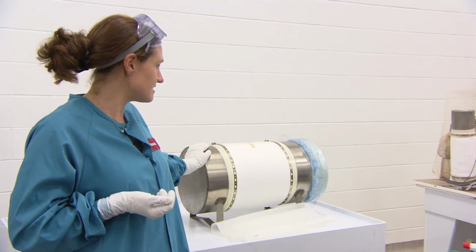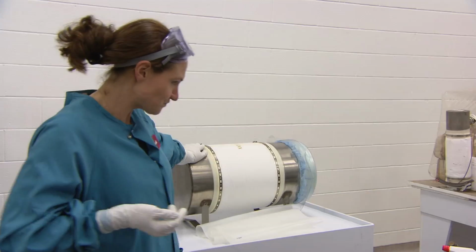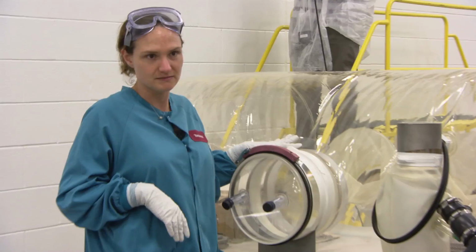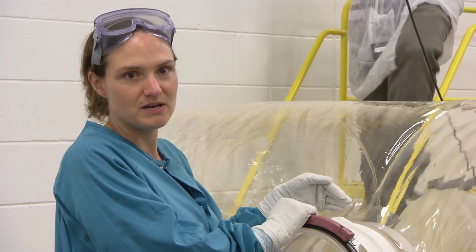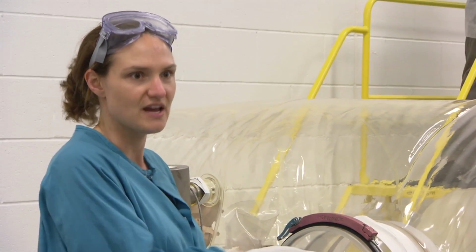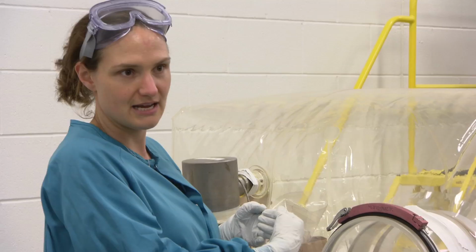The first thing that I'm going to do is attach a cylinder. So this way we're going to be entering supplies, so that when our animals get here, our isolator is stocked and ready to go. The first thing that we want to do is take a look at our port, and make sure that our inside cap has a nice bubble on it. That way we know that the last time we sterilized this cap and used our atomizer to create pressure, the pressure is still there and we don't have any holes. If we did have holes, that inside cap would be sunken in.